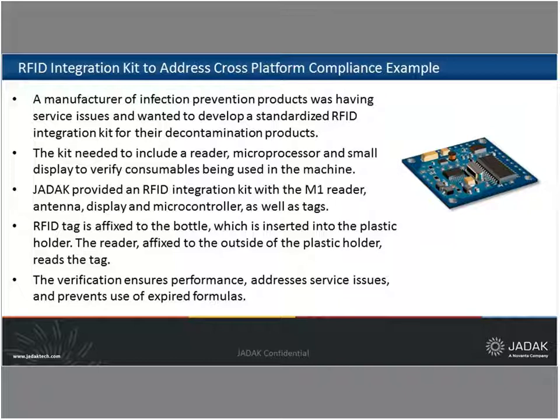So in this case, the RFID reader is used to verify the consumables being used in the machine, and this is to ensure that the performance is correct and also to prevent the use of expired formulas, and making sure that the formula is appropriate for the device that is actually inserted in. In this particular case, the customer was less worried about counterfeiting and really more worried about their own variety of formulas being used properly in their various devices.